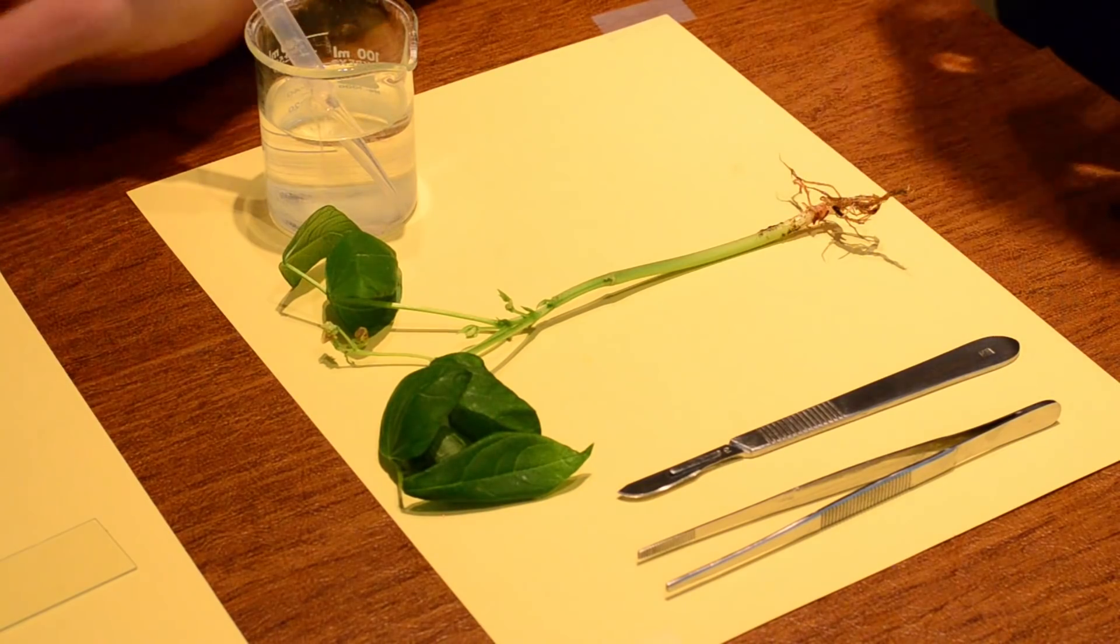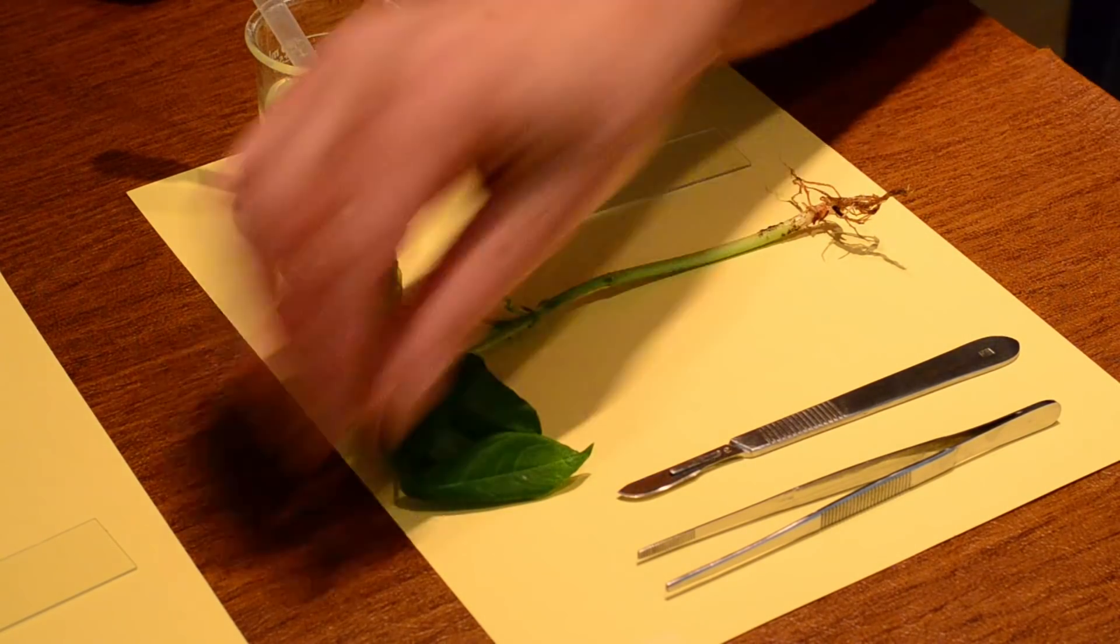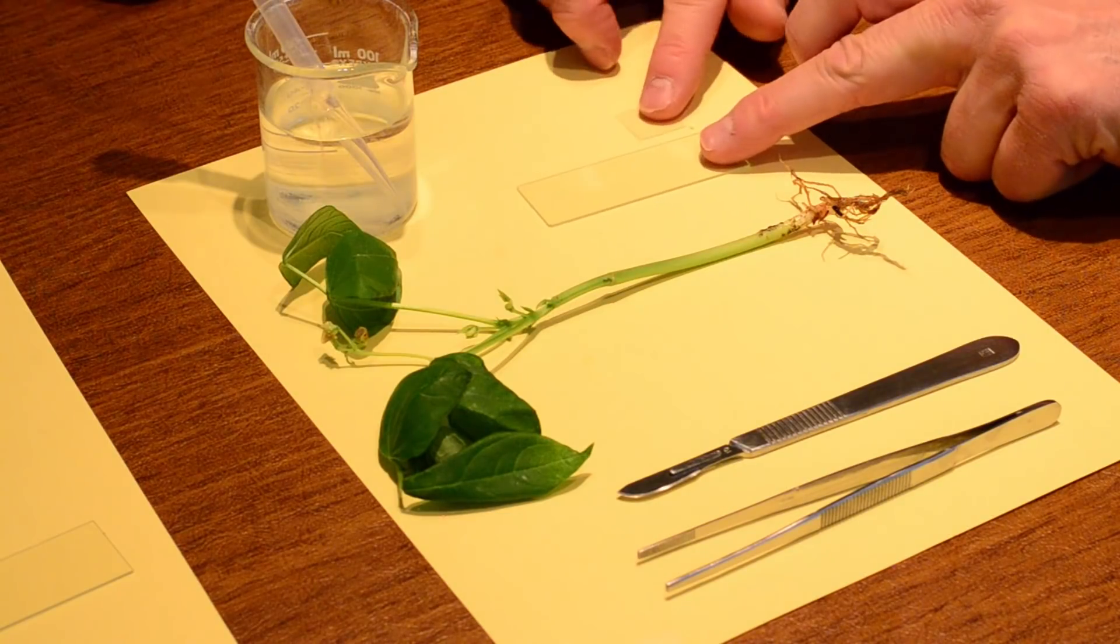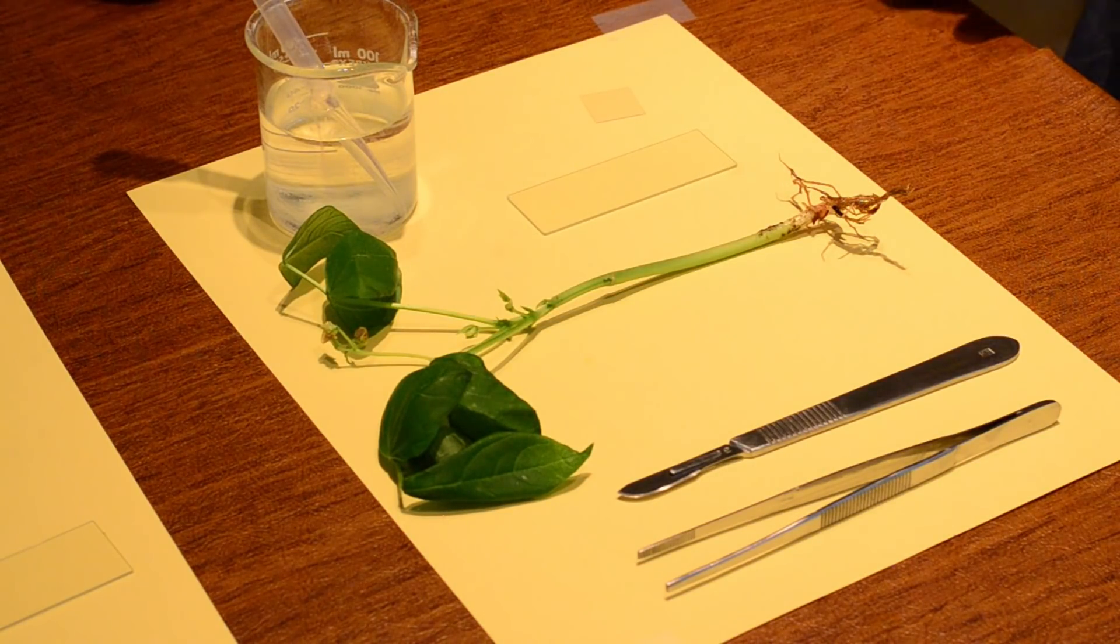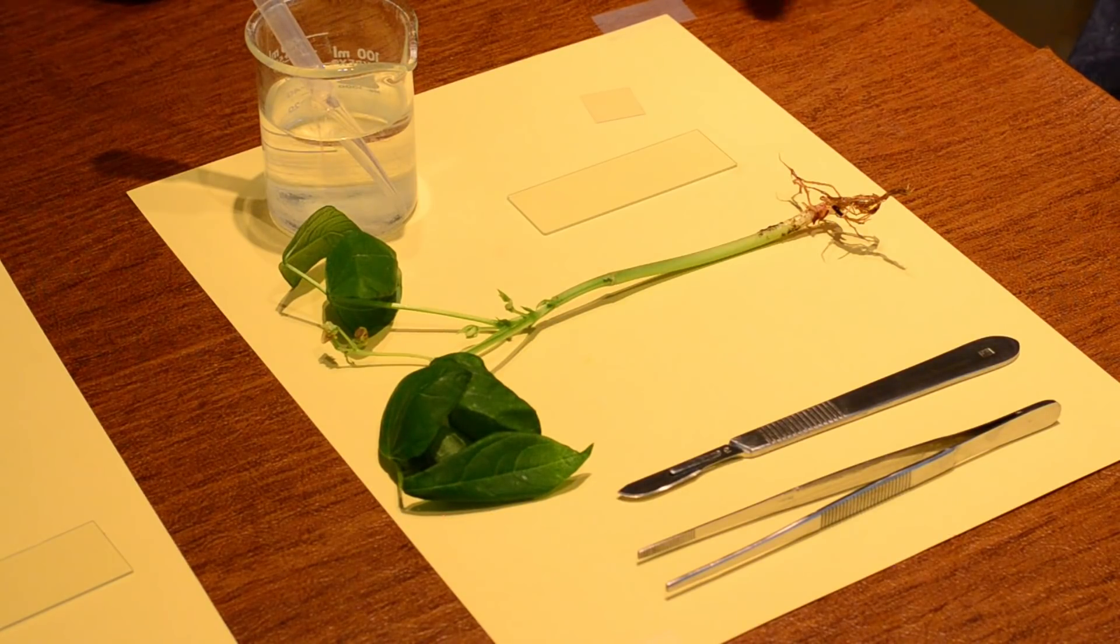And of course, we're going to have a slide and we're going to have a cover slip. So these are the things that we'll need. Alright, so first, let's go ahead and do a cross section of the stem.